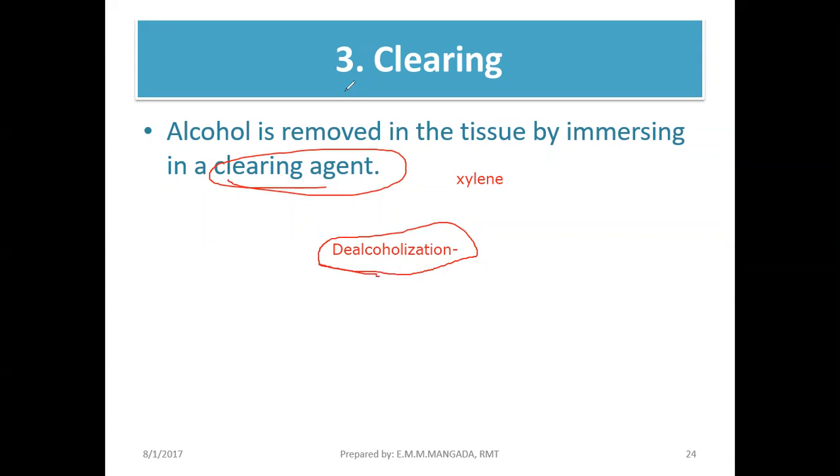Because, guys, most of our clearing agents, if not all, literally make the tissue clear. Okay, they have high refractive indices. So yung mga ginagamit natin na mga clearing agents, if not all of them, most of them, literally make the tissue clear. Kaya tinawag din siyang clearing. Ibig sabihin, pag kiniklear niya yung tissue natin, mas madali siyang i-visualize later doon sa microscope natin.